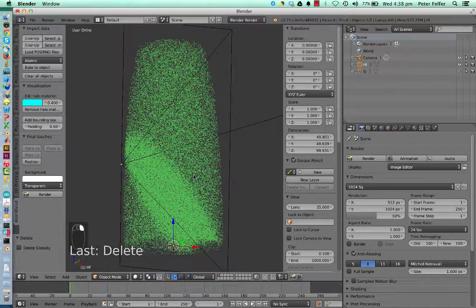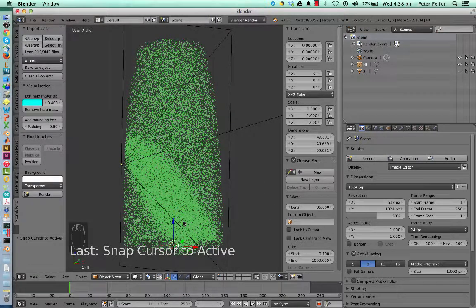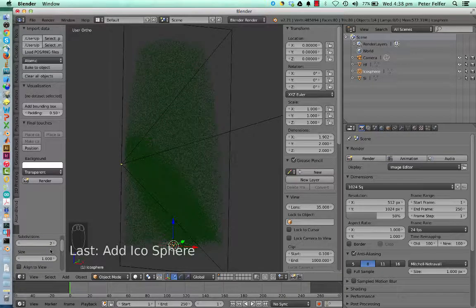So the first thing is you select your mesh, and go Shift S for Snap, Cursor to Active, which is where it was already, just to show you need to do that. Then Shift A, Add Mesh, Icosphere, which adds the icosphere exactly at the origin of our mesh, so that things are not offset later. You can leave the subdivisions at 2. You might actually crank it down and use the subdivision surface modifier later. Actually, we're going to do that so you can see the effect of that. And the size, I'll make it 0.2. So it's a relatively small one, or let's make it 0.4 anyway.